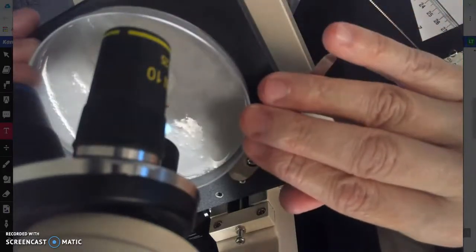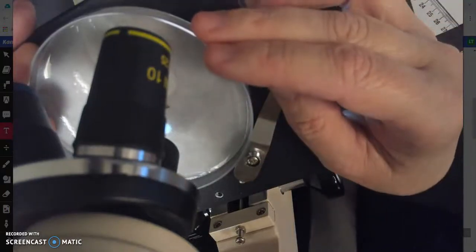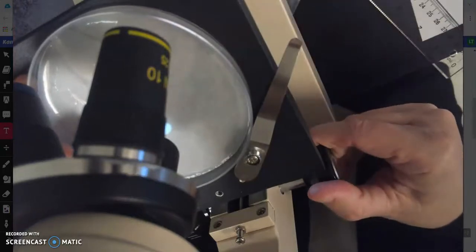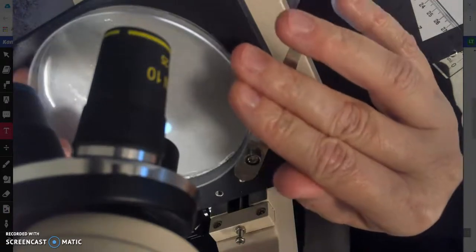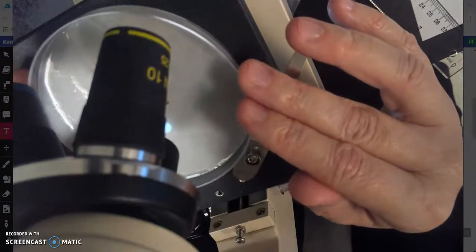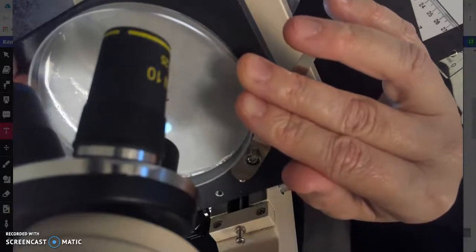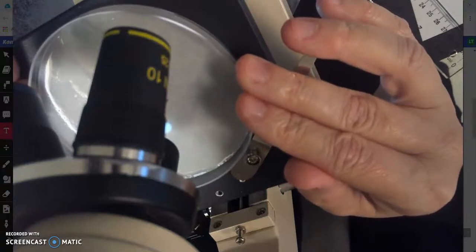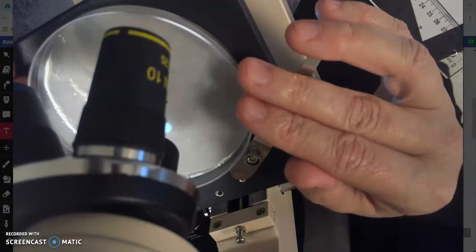Okay, now I'm going to look at fragment 2. Okay, fragment 2. 2, 4, 6, 8, 10, 12, 14, 16, 18, 20, 22, 24, 26, 28, 30, 32, 34, 36, 38, 40, 42, 44, 46.